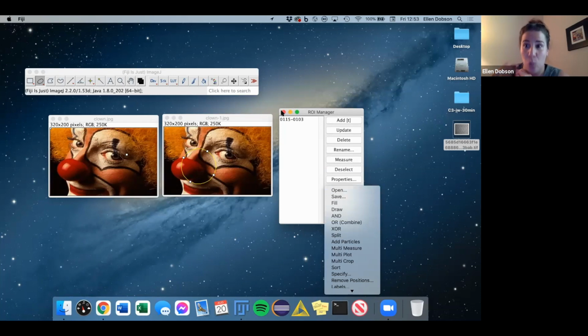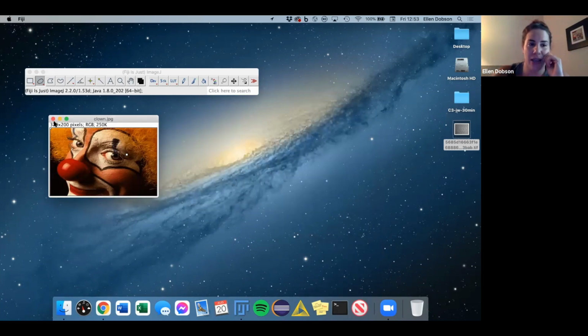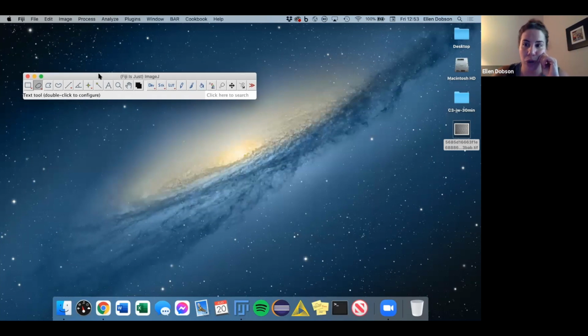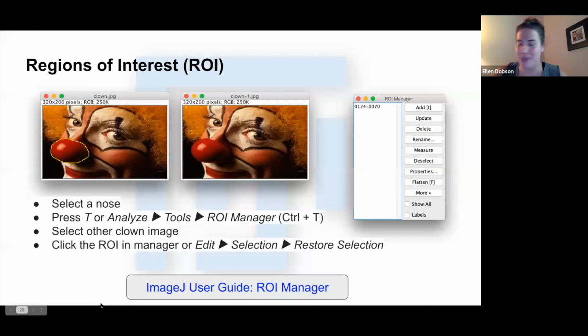Again, we'll go over this in way more detail in the next workshop. This is just a brief introduction of what these tools are. We're going to do some more serious work on how I can actually use them and apply them in my image analysis workflows next week, and then how to actually automate them as well, doing scripting. So that's where all the really goody stuff comes in. So yeah, we did this.